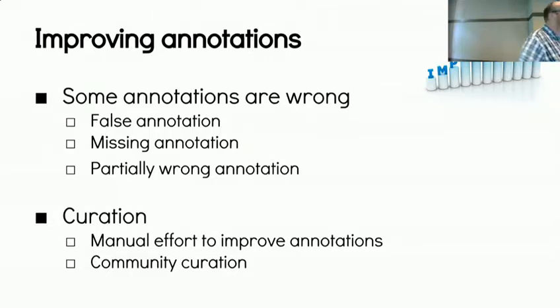So I'll just sort of move along a bit. You're welcome to keep going, but I just want to say, we've done this annotation. It's like an automatic annotation. It's kind of mostly right, but it's not going to be exactly right. And in fact, our understanding of proteins changes over time. A protein that we knew nothing about this year, in a few years may have been characterized in E. coli, say, and it might be applicable to our bacteria. So we want to update our annotation.